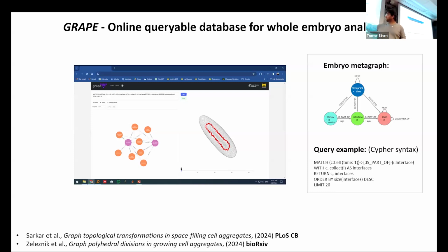So we define a tissue in terms of the tricellular vertices between the cells, the interfaces between two cells, the cells themselves, and then the time point. All of this creates an absurdly compact way to query the data, and it's fully generic. For example, the query that brought that was written in like 4 or 5 lines that are very simple and very intuitive. So that's already one big step toward simplicity.